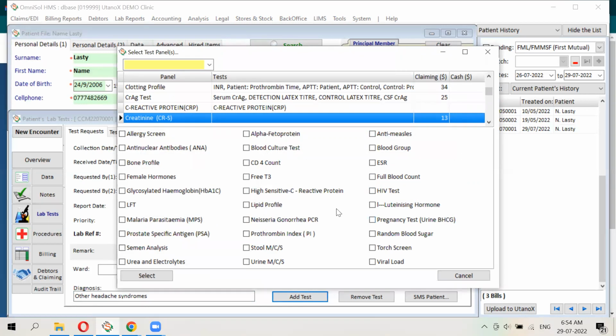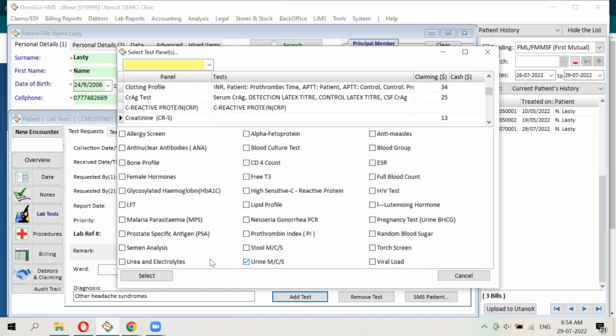So I'm going to pick a cross section for our illustration. I'll pick something from microbiology. I'll pick full blood count. Pick LFT. I want to see what happens. Definitely LFT, yes. I'll also pick an HIV test. Let me also include UNE.